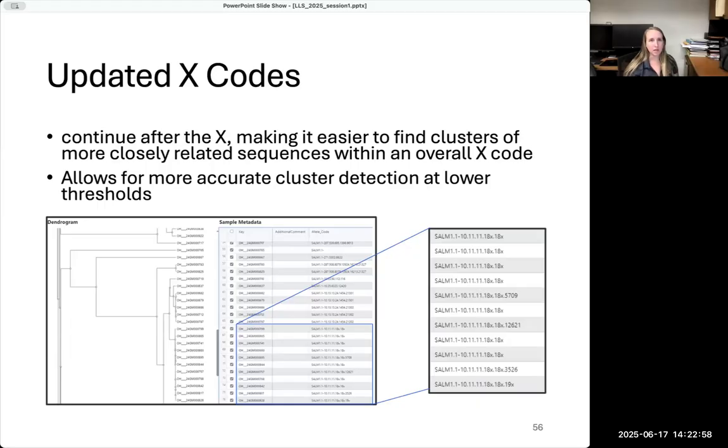I know in Tennessee, especially with Enteritidis, in a slow time of year they might look into 2Z clusters, but during the busy times they may not even deal with the 2Z Enteritidis because there would probably just be a lot. Definitely agree.